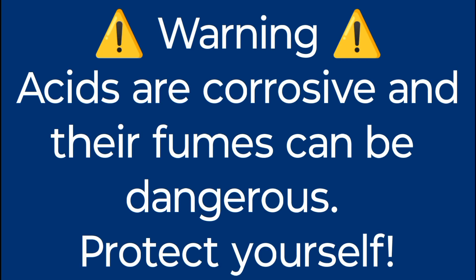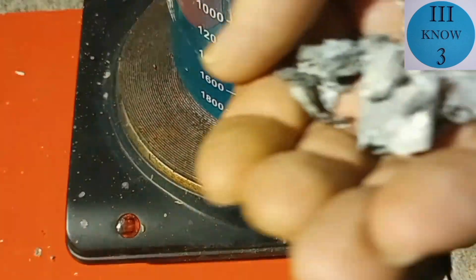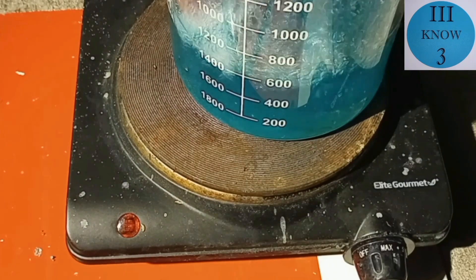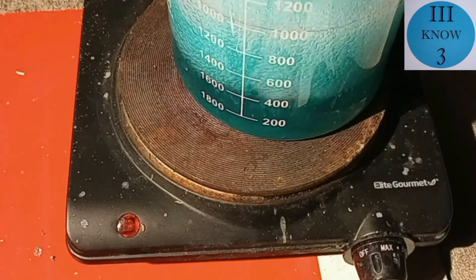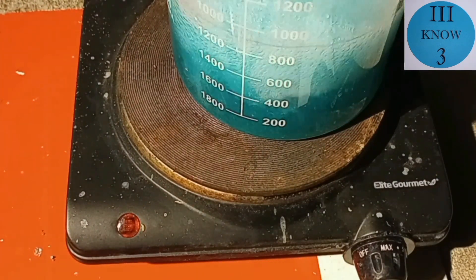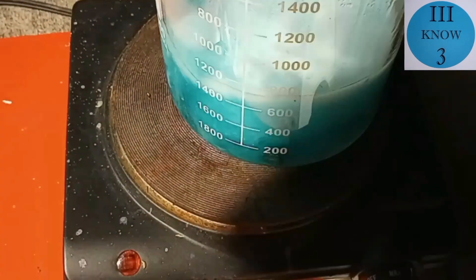Right at the beginning we're going to add about 10 grams of zinc pieces and then I'm going to speed up the video. Right away you can see there's a very good reaction as the zinc is instantly being dissolved.